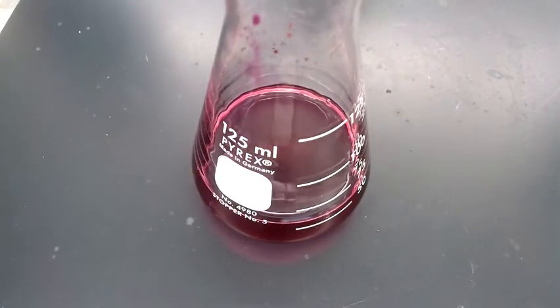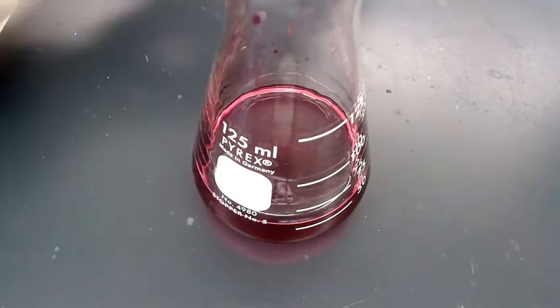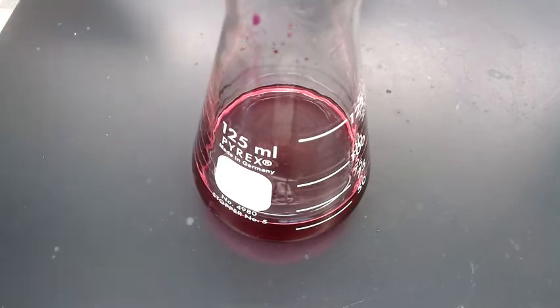It must have stopped. There's no longer the transfer of electrons anymore because it's staying the purple color. So we'll do a calculation for what's really happening in this. But this is a great redox titration, iron sulfate in a solution of sulfuric acid, and most importantly, this potassium permanganate solution. It has a great color indicator on it to indicate when that redox reaction stops happening and why.